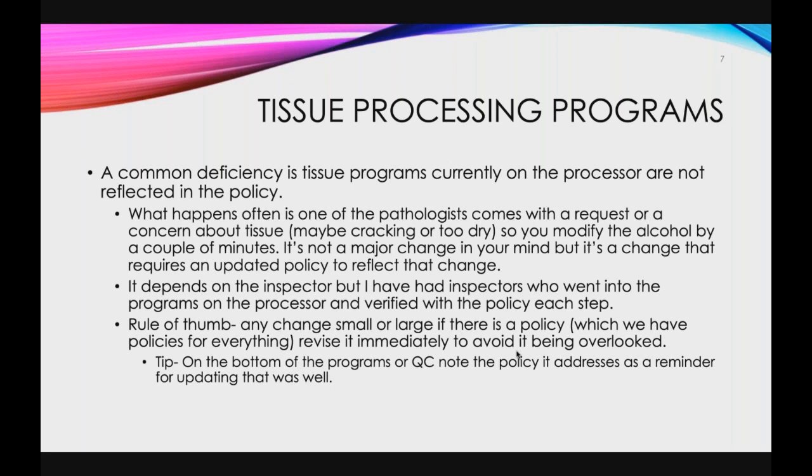We don't want to put it for reprocess. Can you change the formalin? So what happens is you may change, okay, we'll change it a couple of minutes, and you may think that's not a major change, but it is. Any change that doesn't match the policy will be a deficiency.